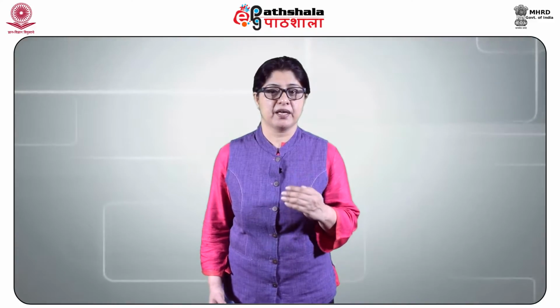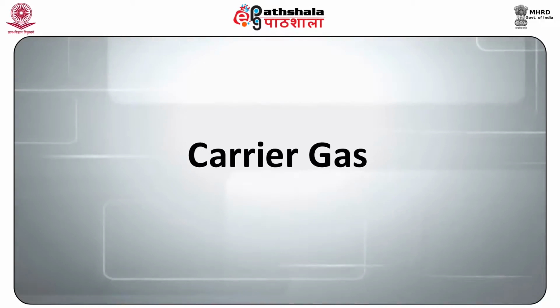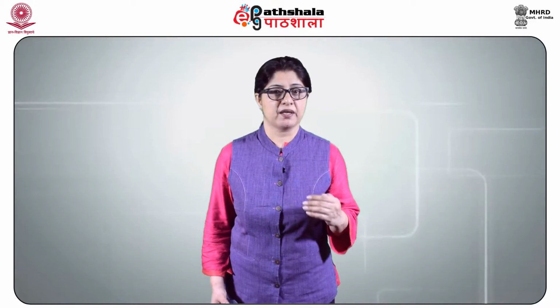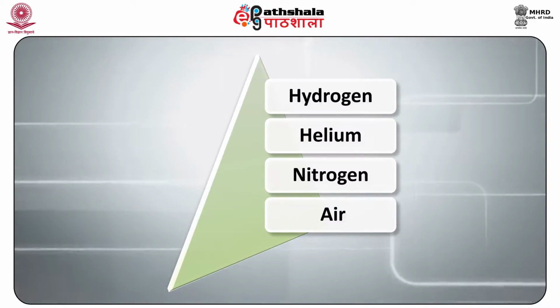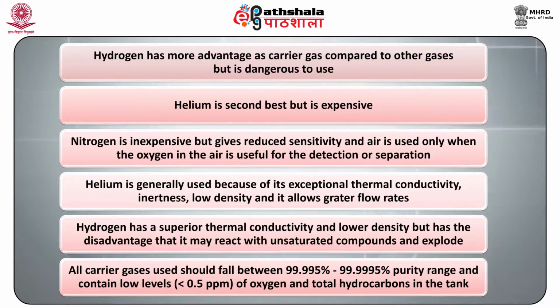The detector can be regarded as the brain of the chromatograph and the column as its heart. The details of the various components of the gas chromatograph are: firstly, the carrier gas. The carrier gas plays a vital role and varies as per applications. Carrier gas should be dry, free of oxygen and chemically inert. The most extensively used carrier gases are hydrogen, helium, nitrogen and air. Hydrogen has more advantage as a carrier gas compared to the other gases, but is dangerous to use. Helium is second best but is expensive. Nitrogen is inexpensive but gives reduced sensitivity, and air is used only when the oxygen in the air is useful for the detection or separation.